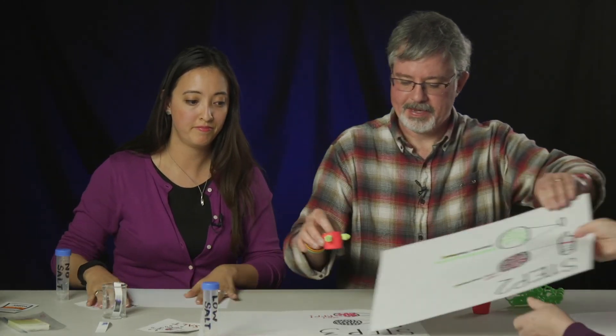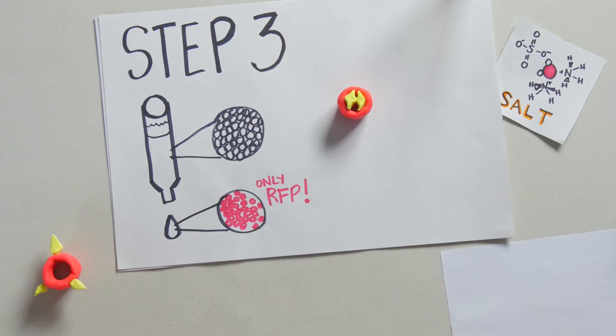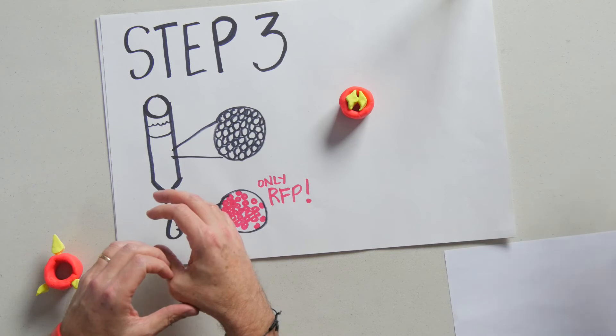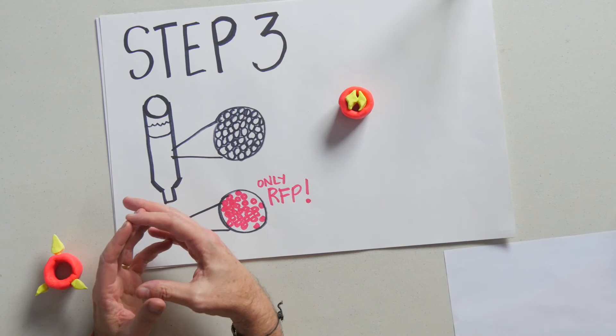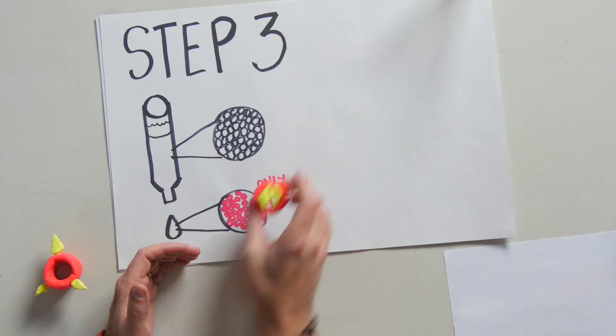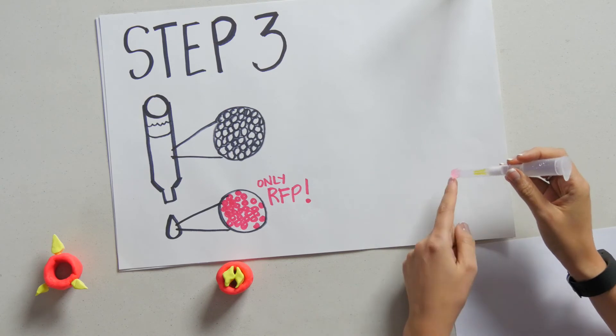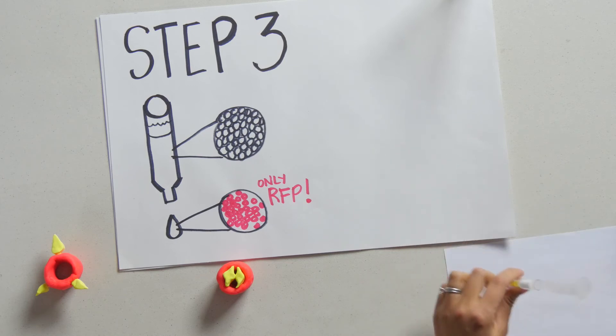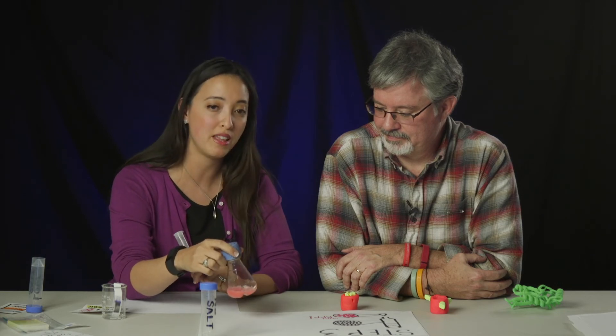And then, for the last step, we're going to go with no-salt. And in no-salt, the protein is going to change its shape. So now that the hydrophobic regions are inside the protein, they're not exposed to the aqueous environment, and this is not going to allow it to interact with the resin of the column, and it's going to flow through, and we'll be able to collect it. So they call this no-salt buffer an eluting buffer because it's actually going to let go of the column and come out or elute. So now you can see, in the bottom in our collection tube, we actually have some RFP. And it turns out, this is one way to get a really concentrated solution of only RFP. This is one way to purify the protein.